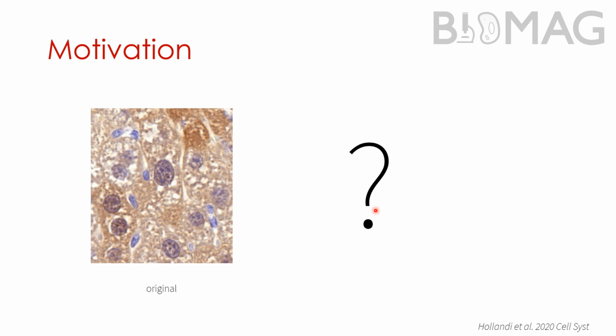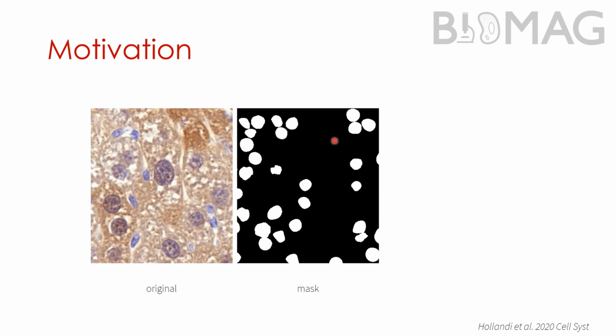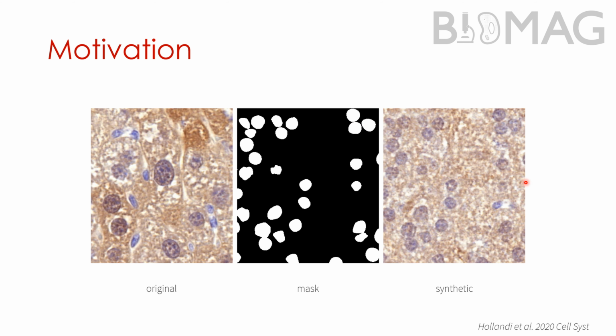So what we thought to do was to generate a synthetic binary mask where the white areas mark the nuclei and everything else is the background, and we want to simulate nuclei in these white areas. So we did that so that we can have new synthetic microscopy images with the faithful texture representation of the original style, both for the foreground and the background. The background is also important for training purposes. And you can see that these 3 objects correspond to these masks here.